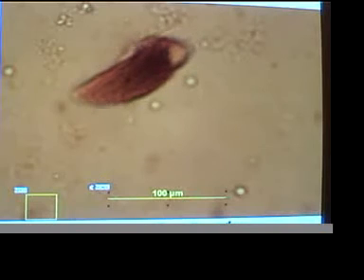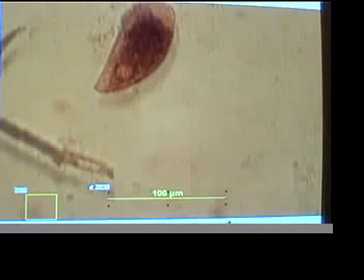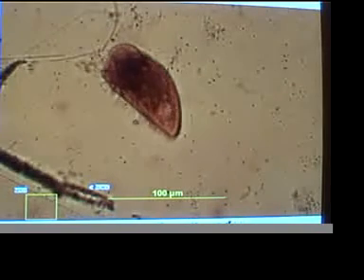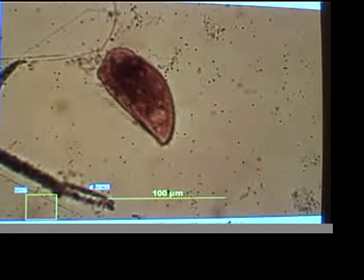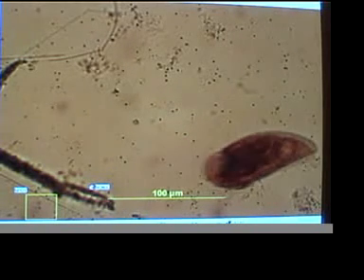He's pretty small, so let's try to zoom in on him a little bit. There he goes. He's still slipping, or is that piece of that one who exploded? I'm not sure. Could this be like J.H. Heller, who said that a type of dielectrophoresis could be used to create new organisms? Yeah, this is what's left of the other organism, because it's right next to it.